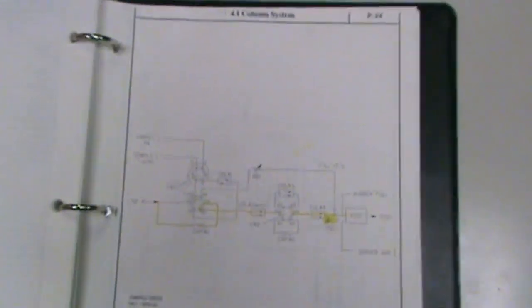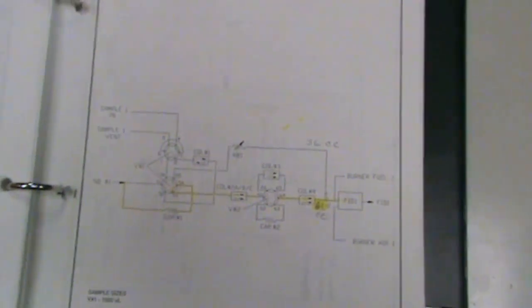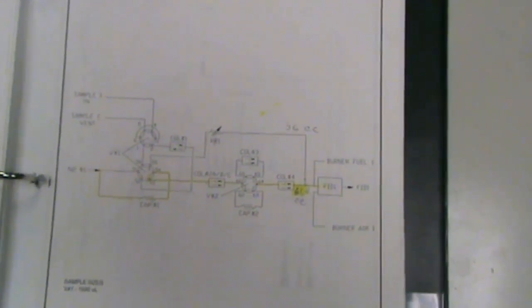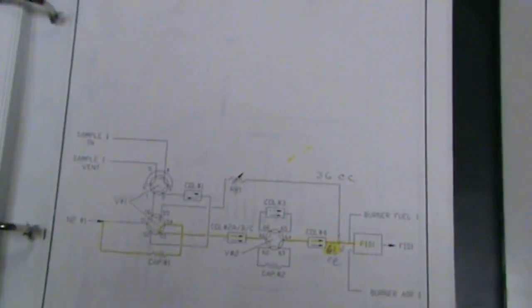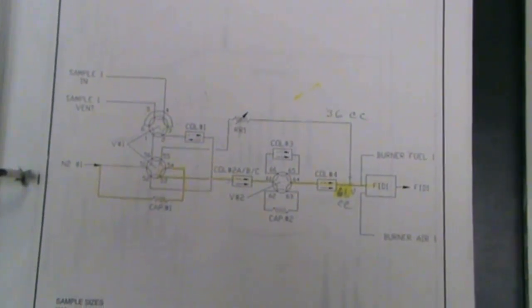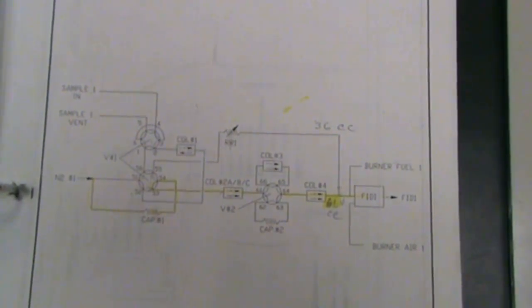And let me find the page that I'll be looking for here. Hold on. Okay, so this is what I'm talking about, and I'm going to bring copies of this so that everybody can follow along, and I will explain this out in detail, but it's on my webpage exactly what's going on here. We're circulating a sample, and it's going to be coming in on port number 4, and the valve will be in the off position, so it will then go to port 3, out, fill our sample loop, come back in on 6, go to 5, and then out.